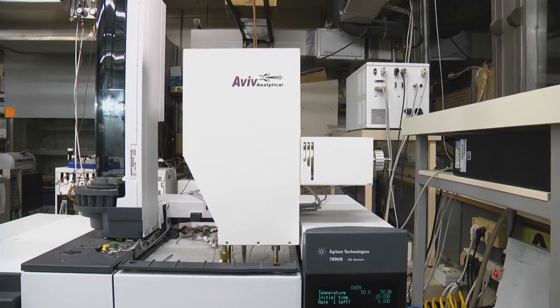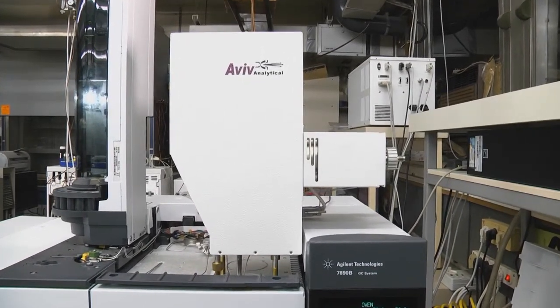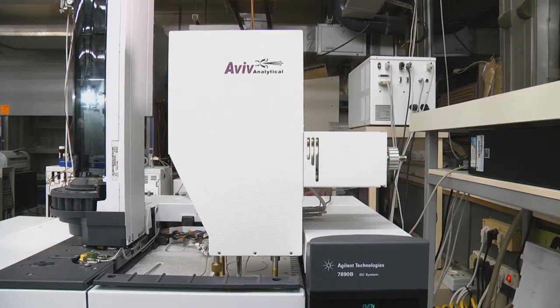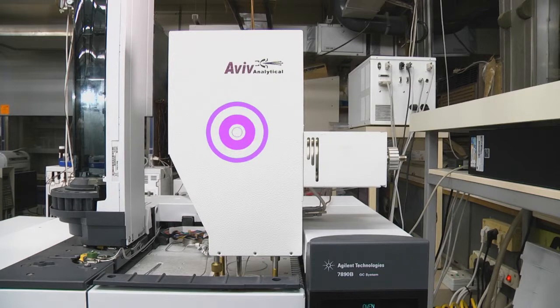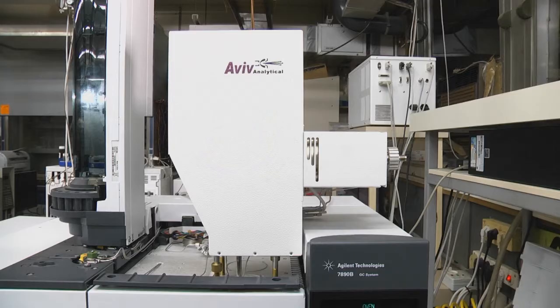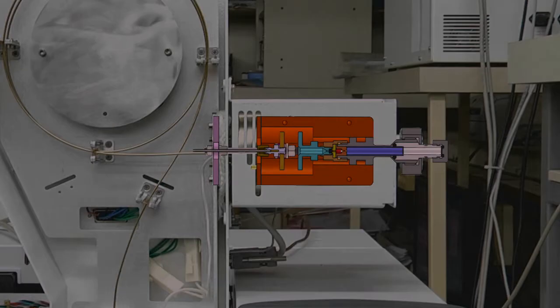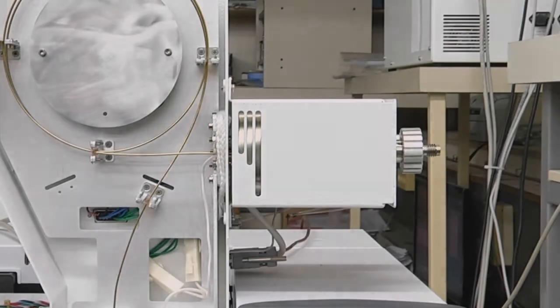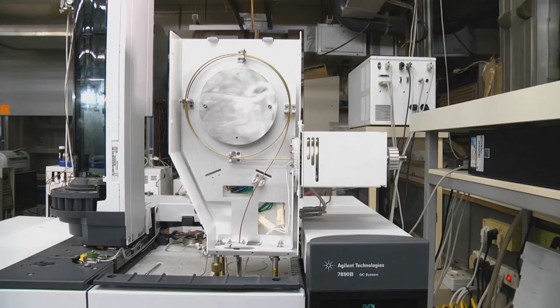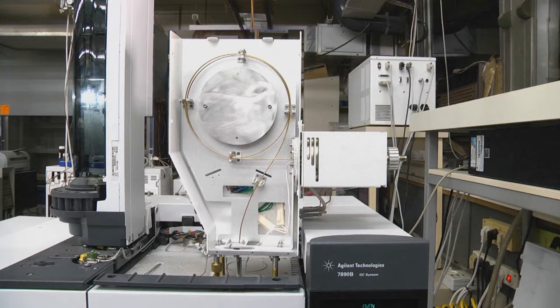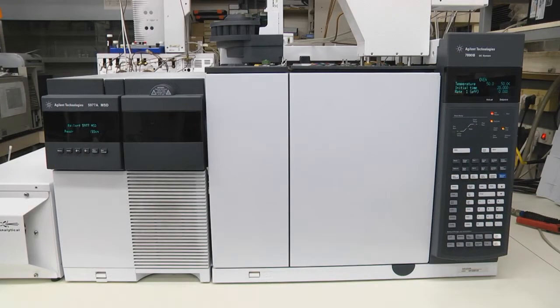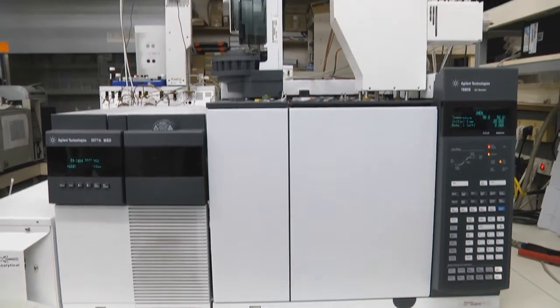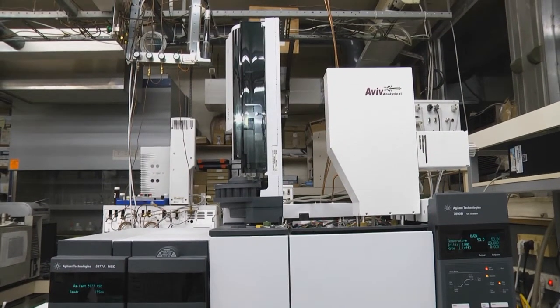The OpenProb FastGC comprises two Aviv Analytical unique technologies: the OpenProb and the FastGC. The OpenProb has a helium-purged heated open oven, while the low thermal mass FastGC is based on a short standard fused silica capillary column inside a resistively heated tube. It enters with a transfer line capillary into the 5977 via a standard MS transfer line.